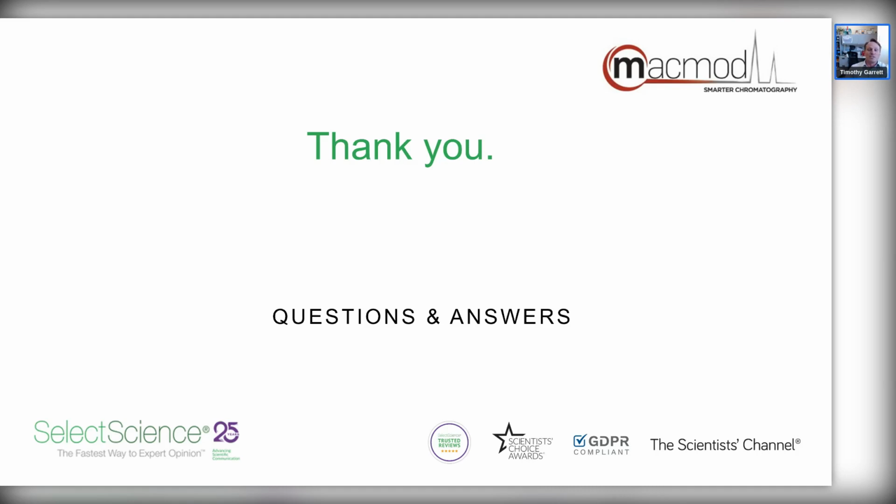Yeah, it's a really good question because we got down to the top 5, and those other 2 were metabolites, and we spent probably 6 months trying to identify them, and we're still not able to add true identities to them. And so it shows some of the difficulties when you have a true unknown, how hard it can be to identify them. Lipids have well-known fragmentation pathways, and so we have good knowledge in terms of how we can classify them. Same thing for peptides, which is what the other one was.